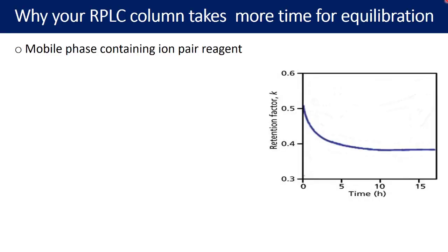The very first reason why your column may require longer equilibration time is a mobile phase containing an ion pair reagent. In reverse phase chromatography, non-polar compounds are retained well, but polar compounds elute early and may lose peak shape or theoretical plates. To retain polar compounds for longer, one can add an ion pair reagent into the mobile phase.